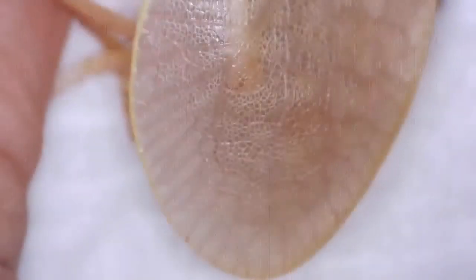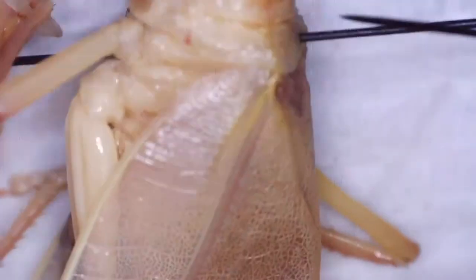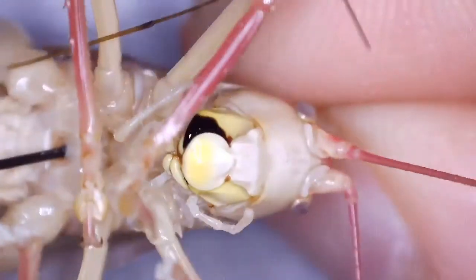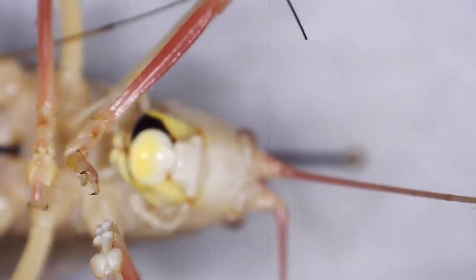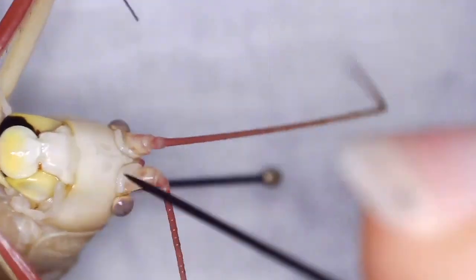And I really like these insects because katydids, one of the things they do is that they have leaf camouflage. So their forewings, they do have two pairs of wings, but the forewings have all of these adaptations to make them look like leaves, including the veins that you would see. And it's the wings underneath that are the more common membranous wings. So I'm just giving you a little bit of some features here, nice chewing mouth parts, and that right there is how you pin an Orthopteran. So hopefully this gives you a little bit more guidance for pinning your insects.